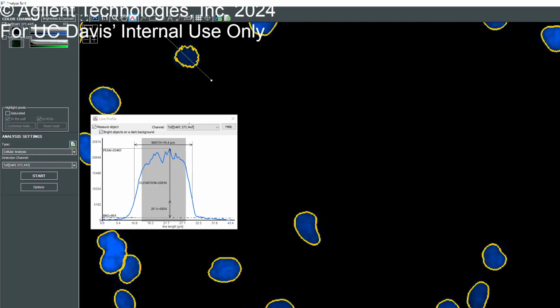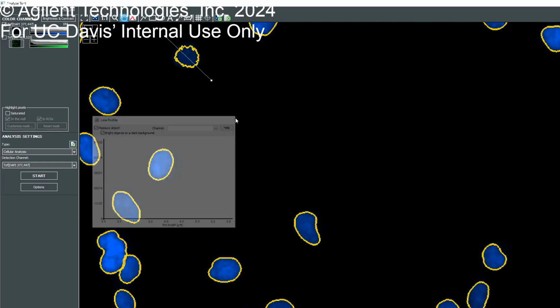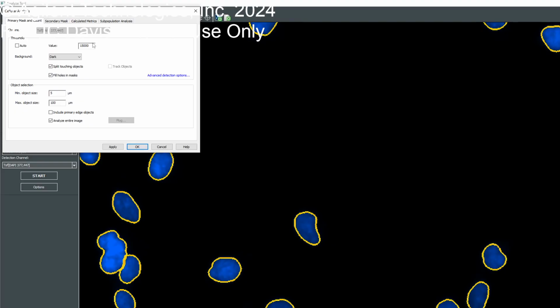Are you saying you recommend setting a threshold at that 25%? Yeah, exactly. You set your threshold at 25%. If I do my math between these 2 numbers, you subtract it and then you just take it once. It's going to be close to this value. So now for that cell, it's about 5,000.